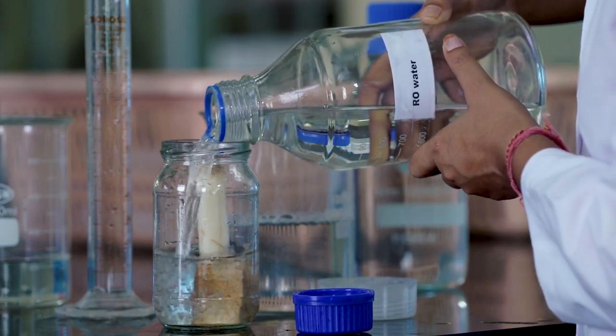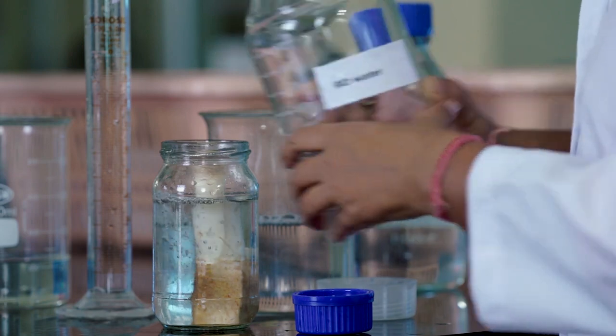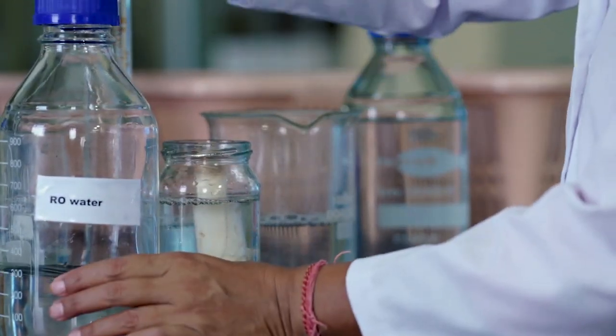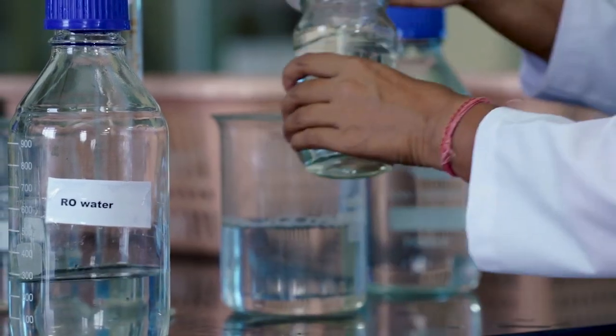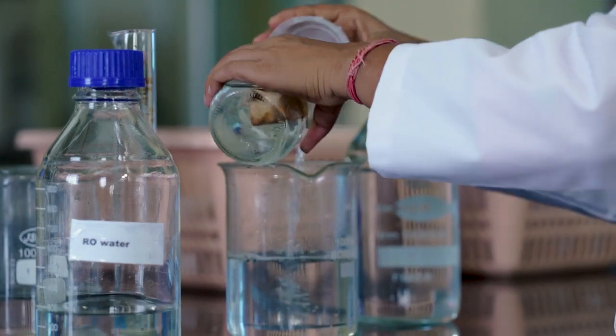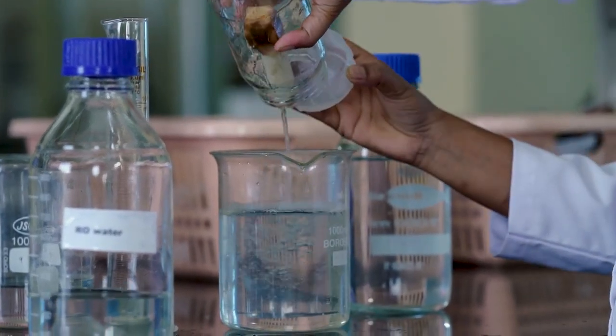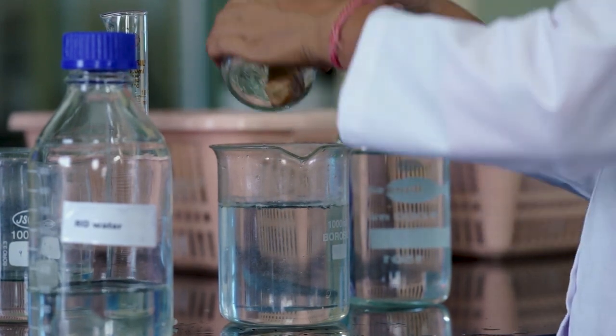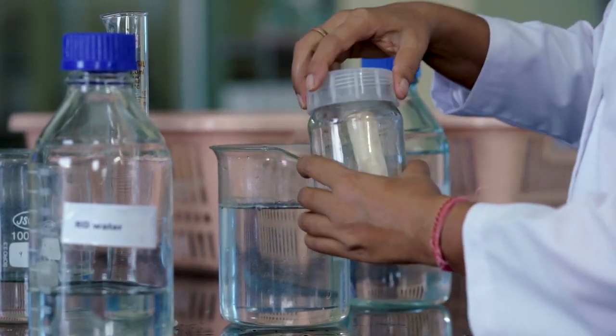After this process, the remaining part of micropropagation has to be carried out within the laminar airflow chamber. For that, we have to carry out the inoculation part in the inoculation chamber where the laminar airflows are installed.